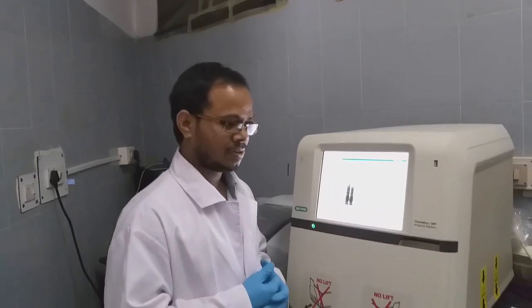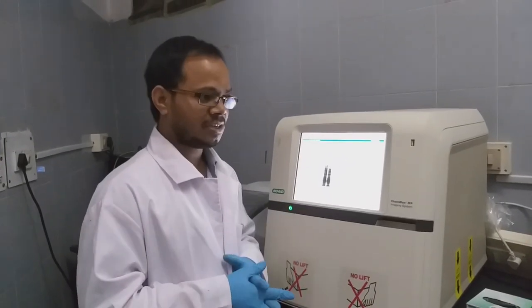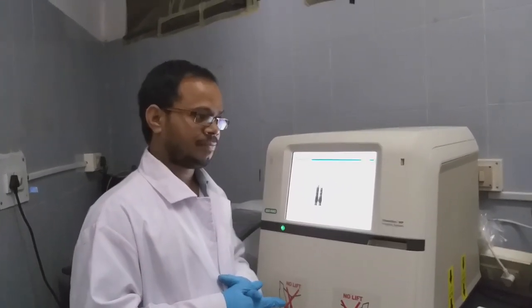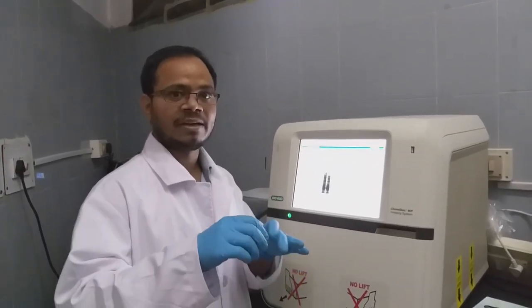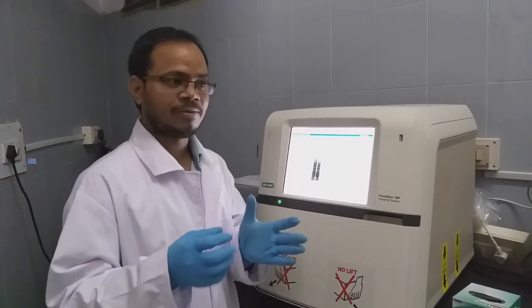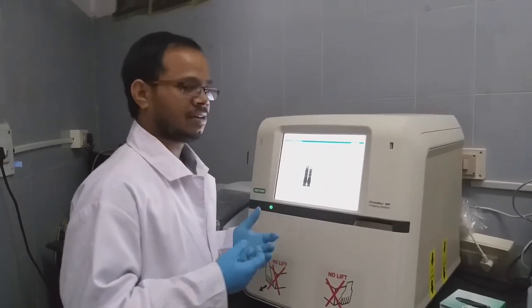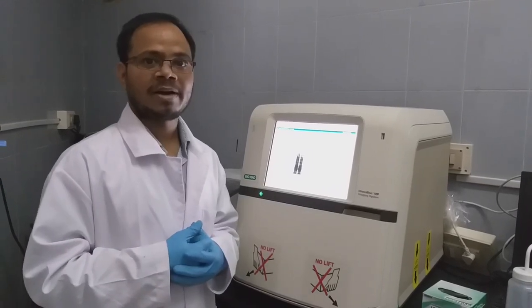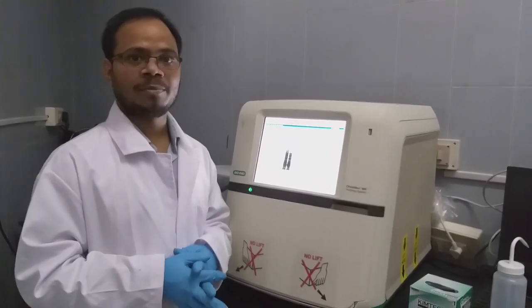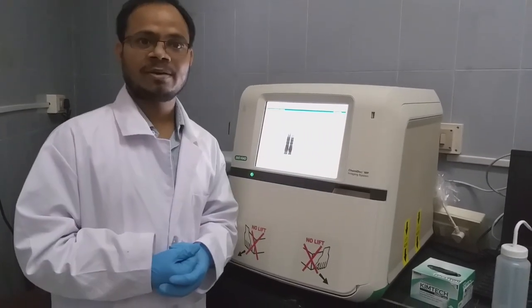These are all other bands that we are seeing in the eluted fractions; those are because of contaminants or degraded protein. Contaminants sometimes may come because of two, three or four histidines in the folded state, which give the possibility to bind to the nickel NTA column. Also, vigorous washing should be done. If you don't wash properly with a high amount of imidazole, that will give you this kind of non-specific binding.